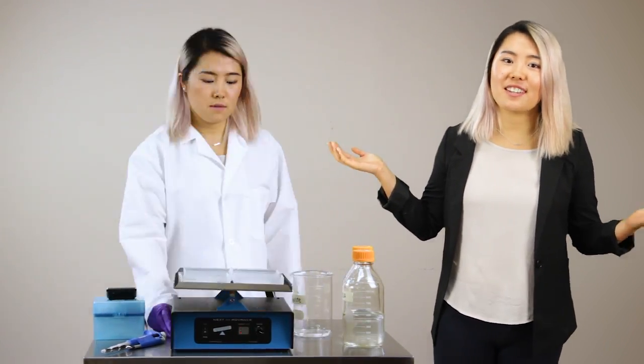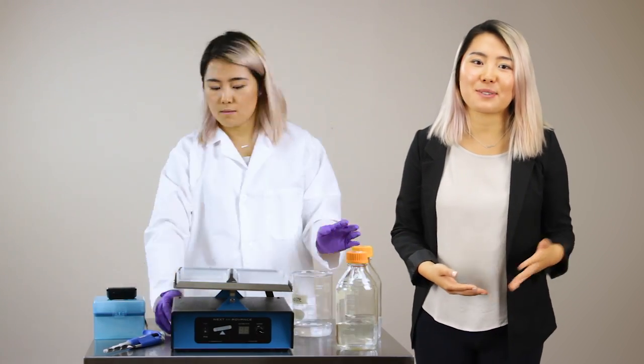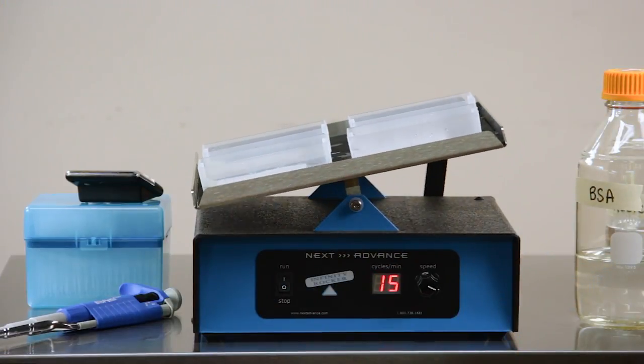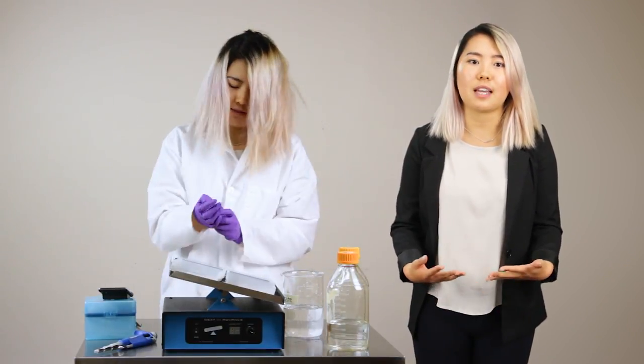If you do molecular biology, you know how tedious it is to wash gels and process blots, and how they can vary from run to run. Even if you just run a few Westerns a week, you probably spend hours upon hours processing them. Imagine how much more productive you and your lab could be if you didn't have to hover over your blots, and think about how much more consistent your results would be from day to day and user to user.